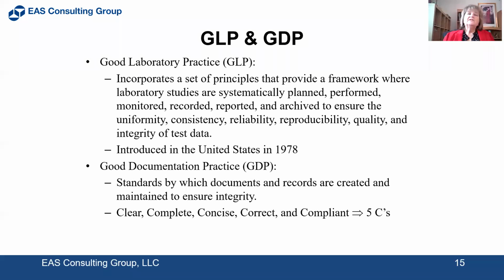And then we also have GDP, which is good documentation practice. It is the standard by which documents and records are created and maintained to ensure integrity. Those written documents should comply with the 5 C's: clear, complete, concise, correct, and compliant.